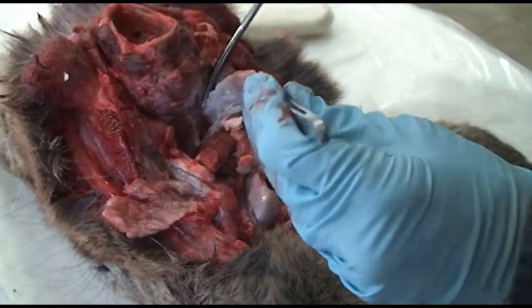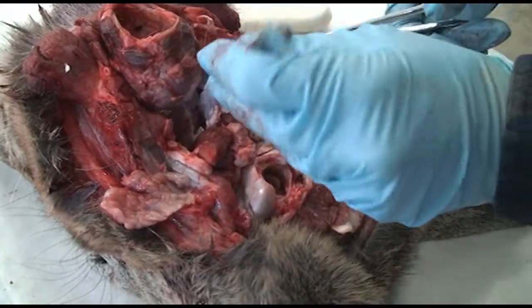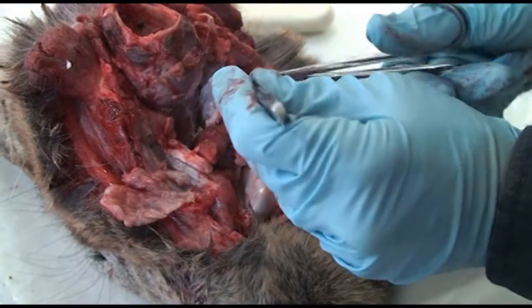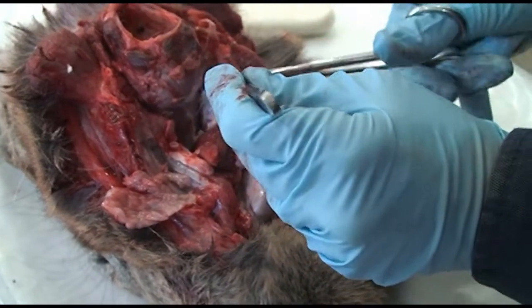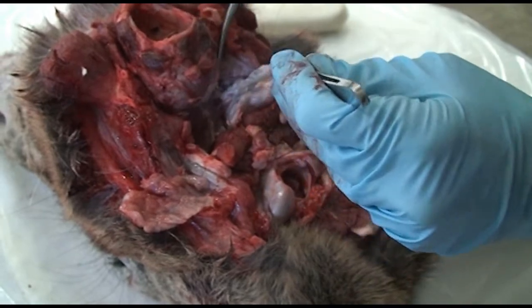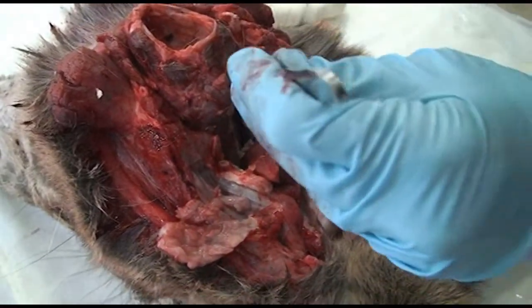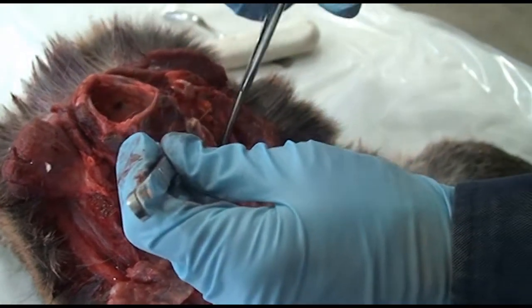If they're real watery, or if you find pus, abscesses, or granulomas within the lymph node, that's something you might call the Board of Animal Health and ask about, and we can come take a look at it and see if it's something we need to send off. We are always looking to make sure we don't have TB in our deer.